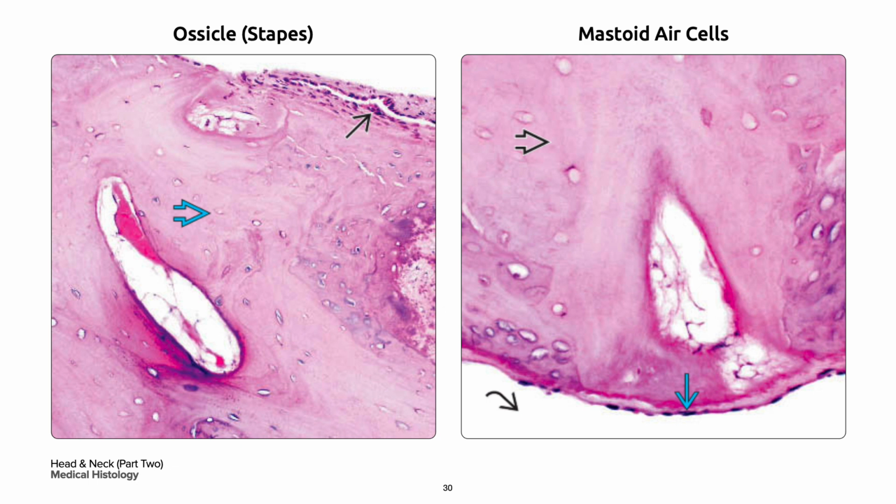On your right are the mastoid air cells, which consist of air-filled cystic spaces in curved black arrow within the dense compact lamellar temporal bone in bold black arrow. Your lining is identical to the tympanic cavity and is tightly adherent to the bone in single blue arrow.